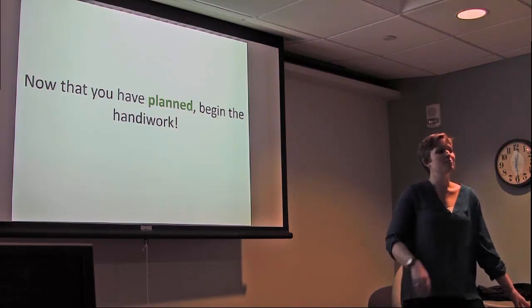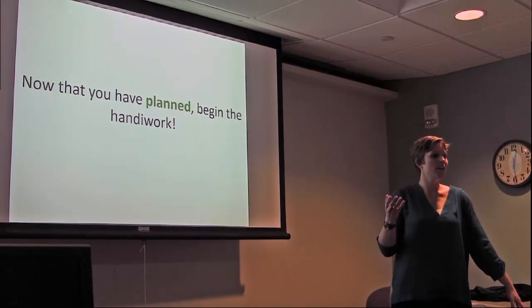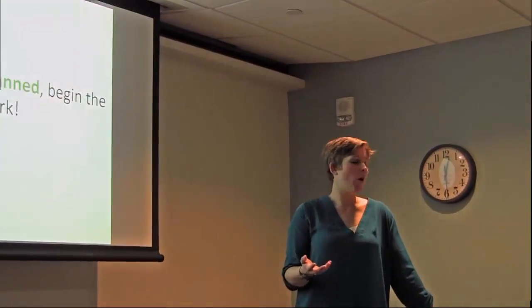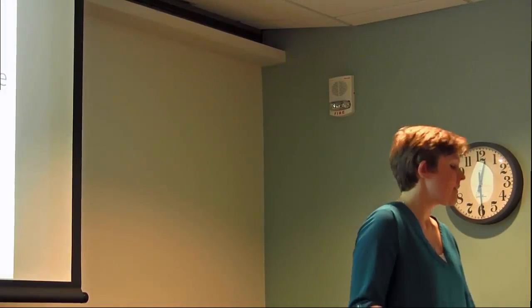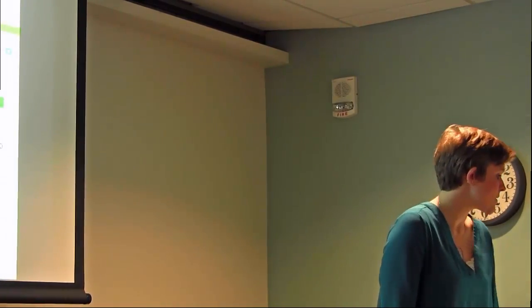Okay, so we've planned it. We know that we've got our insert and it can go into our vector, and we know that there's no frame shift mutation. So all of this is just in silico. You haven't actually done anything towards your final goal. So now we have to go towards the final goal, so we have our handiwork ahead of us.